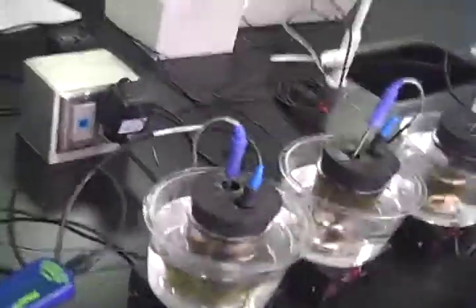The purpose of this lab was to determine how light and different factors affect the rate of oxygen that is created through photosynthesis. As you can see, our equipment, we have the light, the plants inside the jar. We have the GLX, which records the data of the dissolved oxygen, and as you can see right here, these are our data.